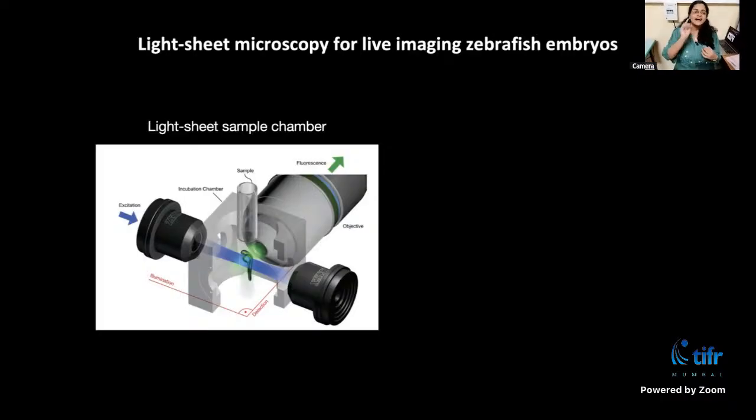And you are able to rotate the plane as it is? Yes, I will show you how that works in the system. We actually will be able to rotate the entire sample and get a three-dimensional view as well. Because by looking at different planes at different times, you are getting a 3D picture. Yes. Okay, so we can move to the scope right now.